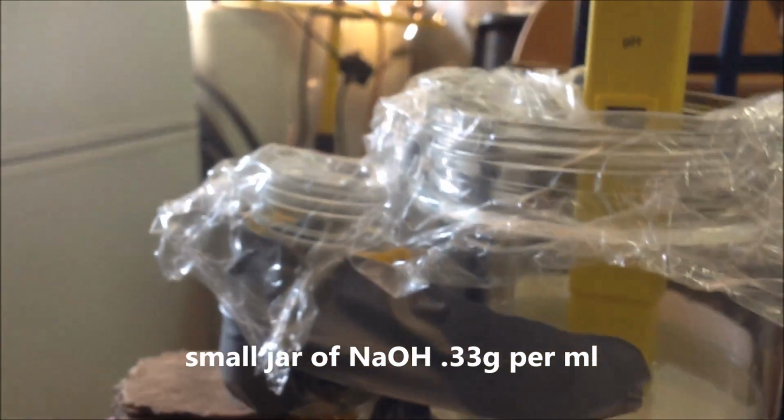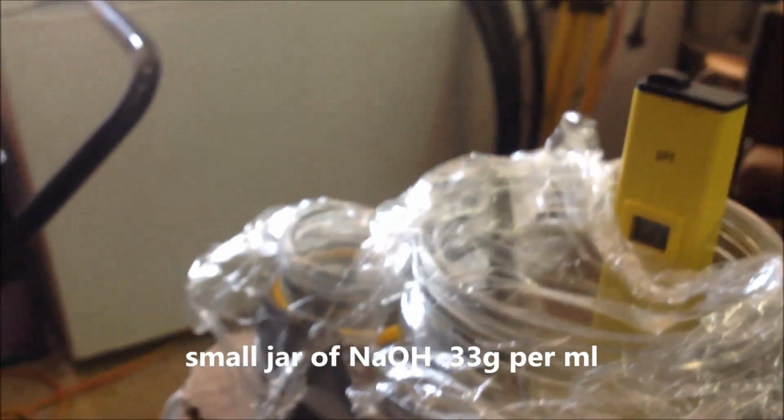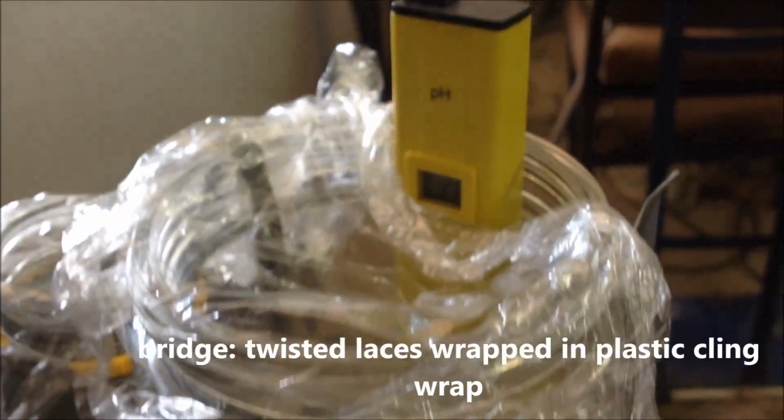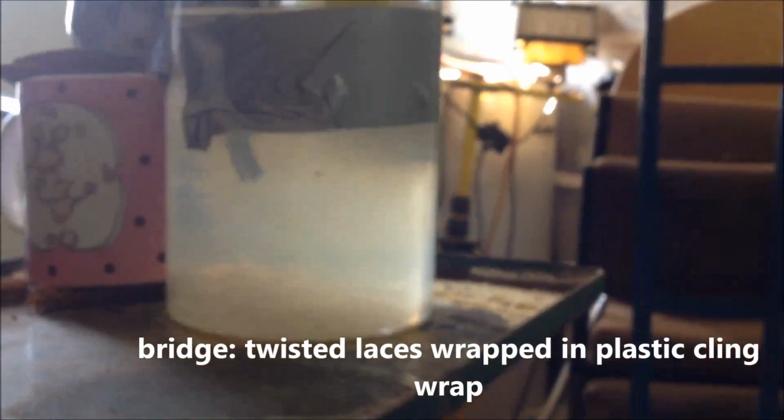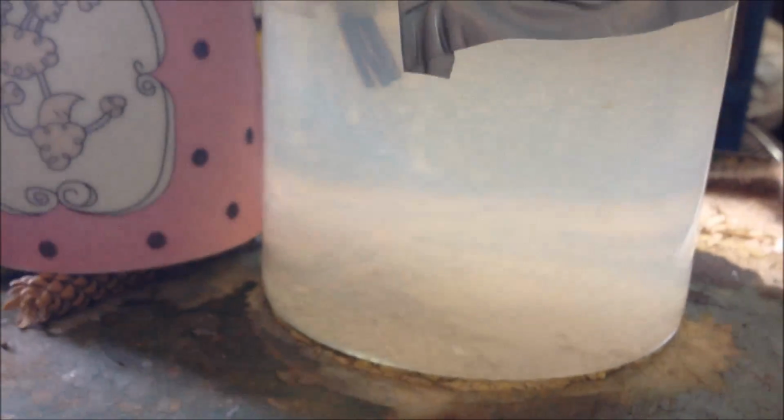And you can see my little piggy back there with a chemical bridge. A few shoelaces twisted together, draped over to the top, down into the solution, and you can see a cloudiness, and I don't know if it'll come up very well, but there is precipitate on the bottom, and it seems to have been forming underneath the wick and the bridge and just dropping onto the bottom of the jar. I'll just see if we can get a better view from this angle. Yeah, I think you can see bits and pieces down the bottom there.